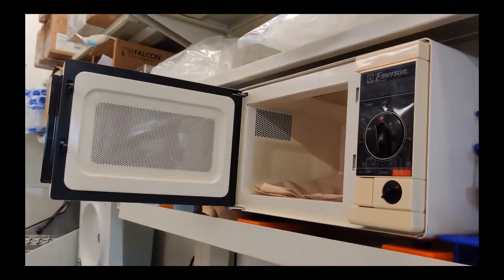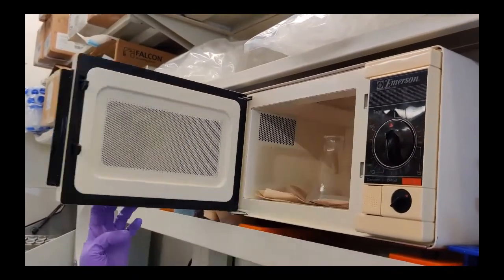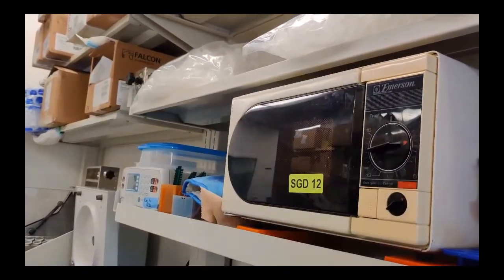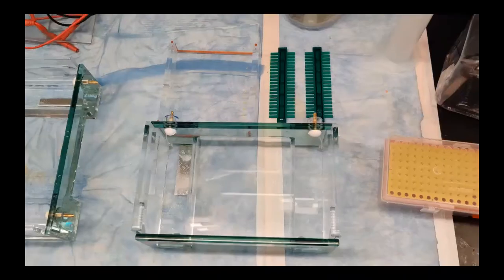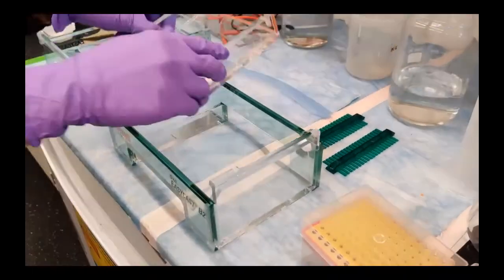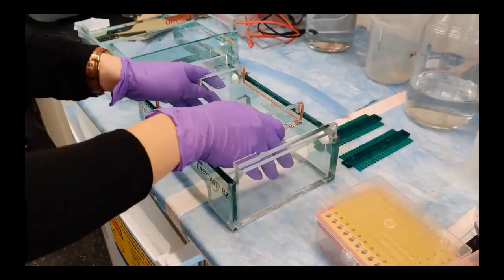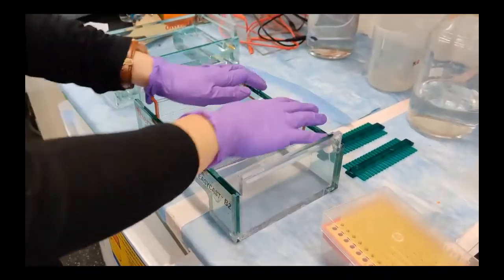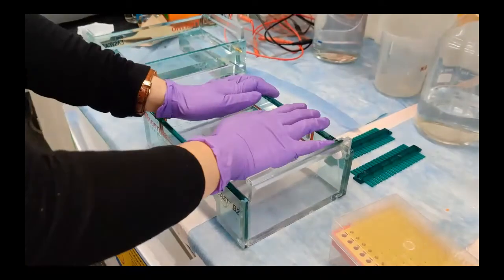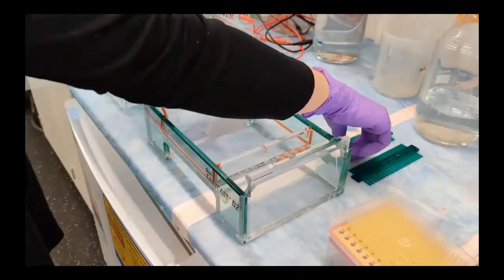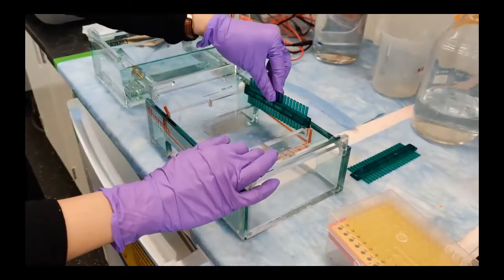To dissolve the powder, we heat it up using a microwave, just like your microwave at home. While the microwave is going, we can set up the tray to mold the gel, similar to making jello at home. The green pieces here are combs to help us shape the wells for us to put our sample into.